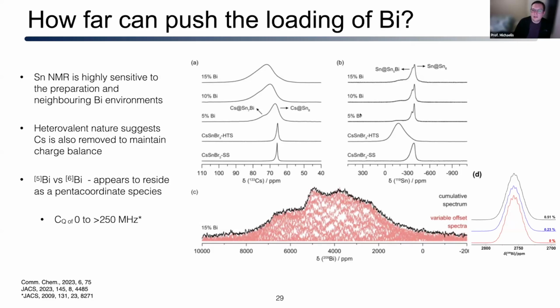We have a nitrogen generation unit in our facility, and we use nitrogen push gas for all MAS experiments. It's usually about 99% or higher, and pure enough to run DNP without freezing up. So I'm not exactly sure why the degradation would happen so quickly in a relatively sealed NMR rotor. But in this particular case, it did break down rapidly.